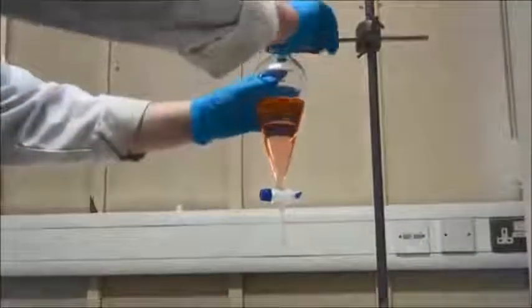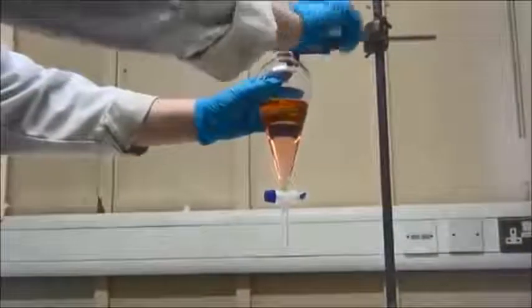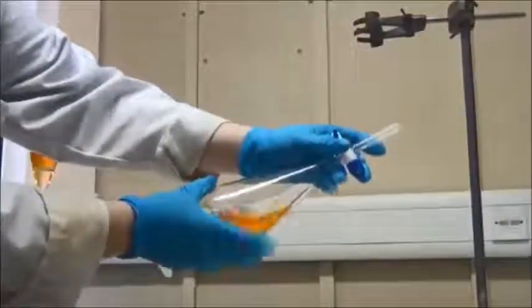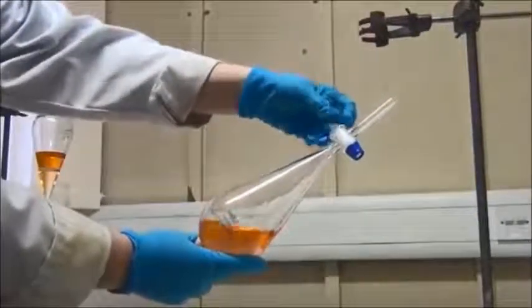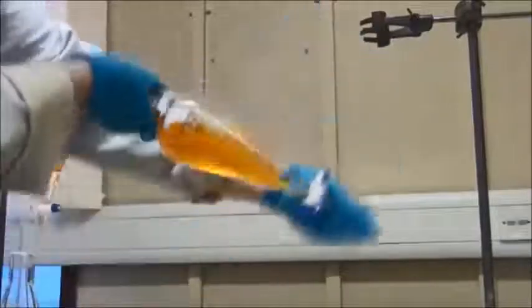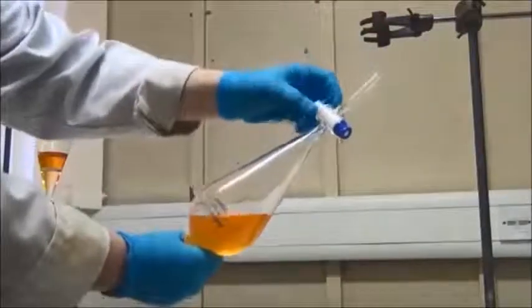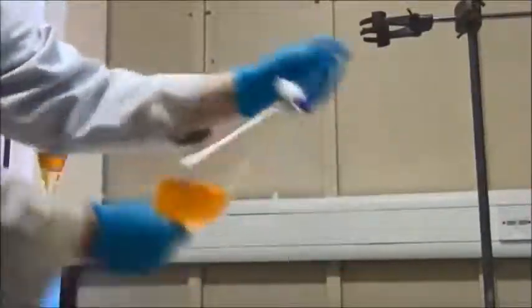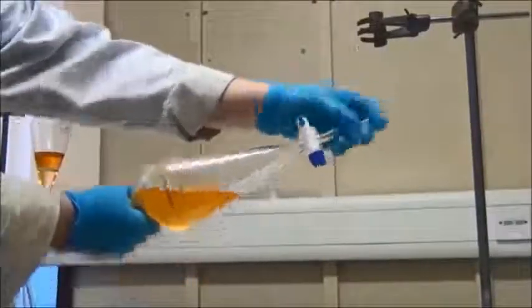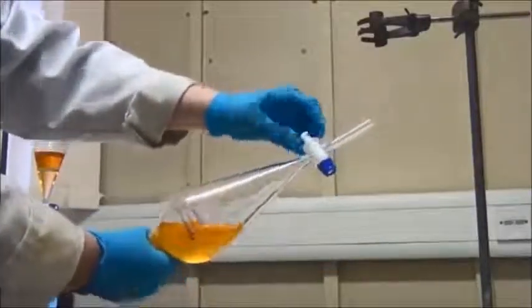In order to carry out an efficient extraction, we must ensure that the organic and aqueous layers are thoroughly mixed. We do this by inverting the funnel. To begin with, you should remove the funnel from the clamp or ring, holding it securely with both hands, and then turn the funnel upside down. When upside down, open the tap to release the pressure that may have built up during the mixing. Then using both hands, invert the funnel 2 to 3 times before opening the tap to release the pressure again.